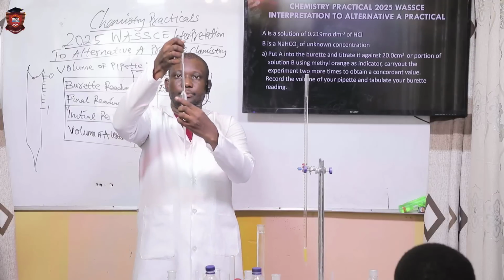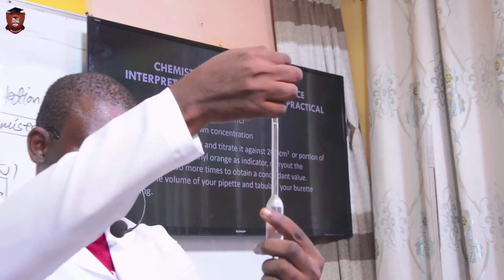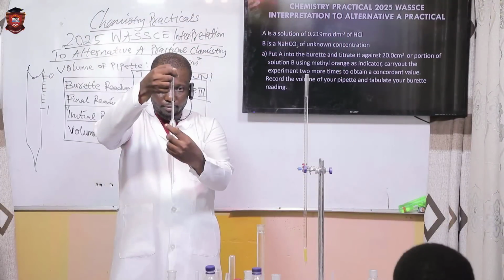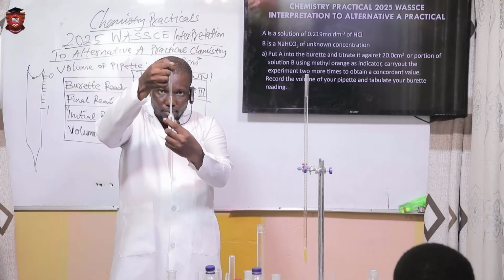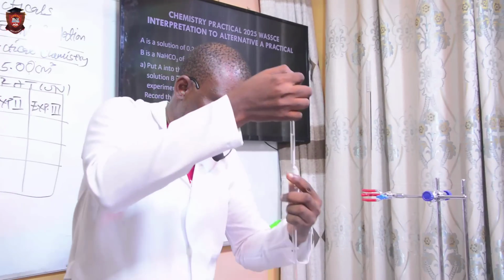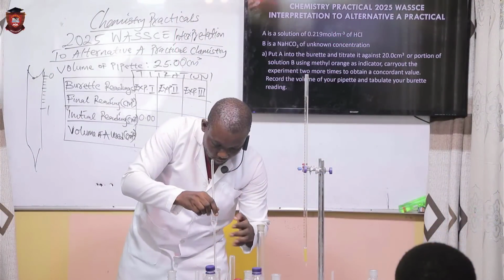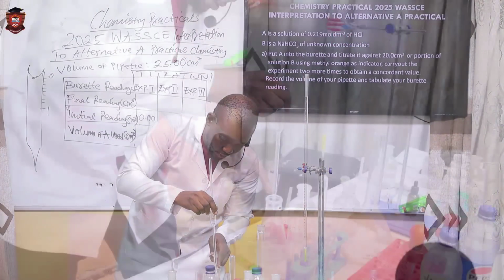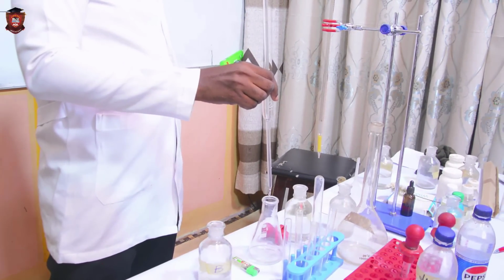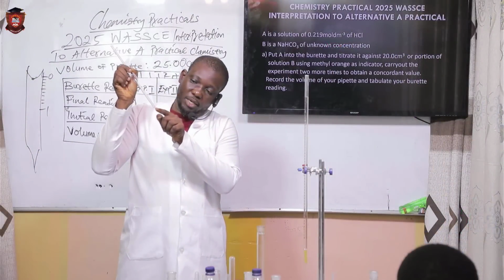So you see where we are looking at. You gradually release until it gets there. Okay, you see it's on the mark now. Okay, transfer, and make sure during transferring that you don't transfer like this. It's not accepted. And never leave a solution remaining here.